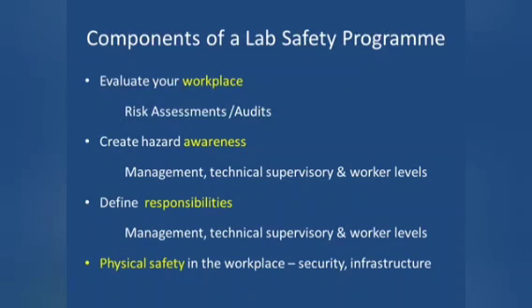The components of a laboratory safety program. First and foremost, evaluate the workplace. Perform risk assessments and conduct internal audits to identify problem areas before finding solutions.